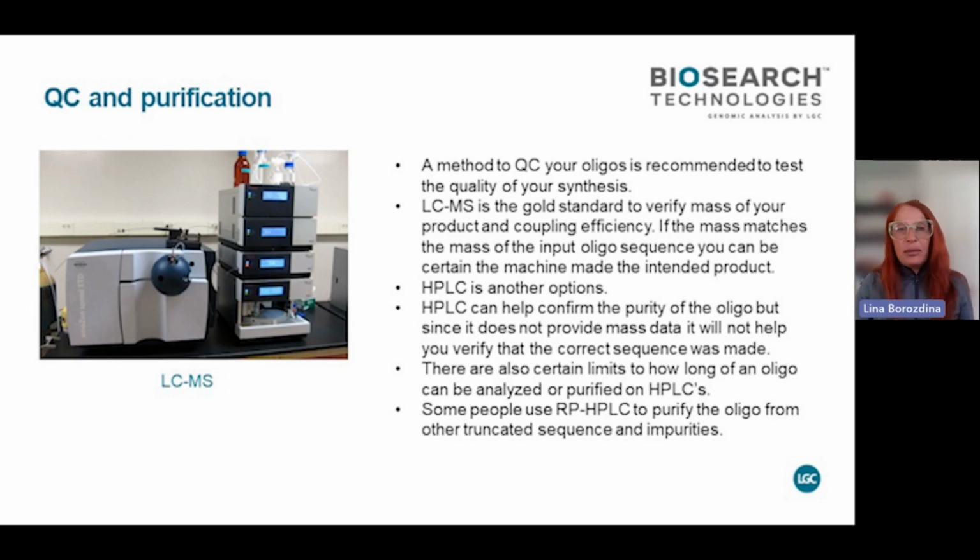The old CombiSep instrument used to take the plate, goes in 96 probes, pulls everything out, and runs it in parallel. So in 1 hour, you will have a profile of your oligo and see how clean it is. HPLC doesn't do that. HPLC does one oligo at a time. So if you have a small throughput, like 4 to 6 to 12 oligos, HPLC is a good option. If you're going for the plate analysis, I would recommend you look into getting a CombiSep.